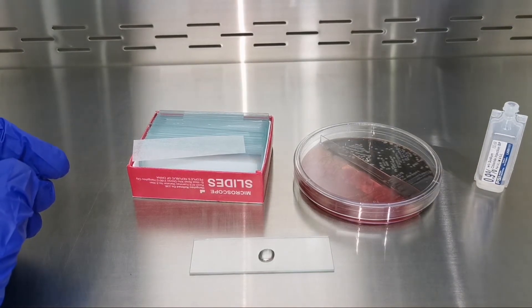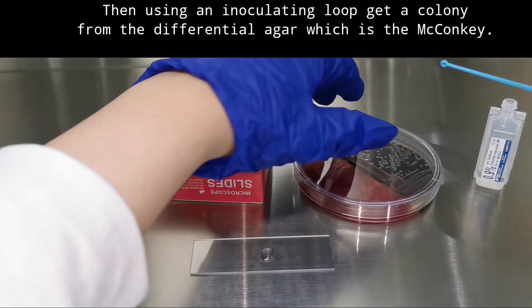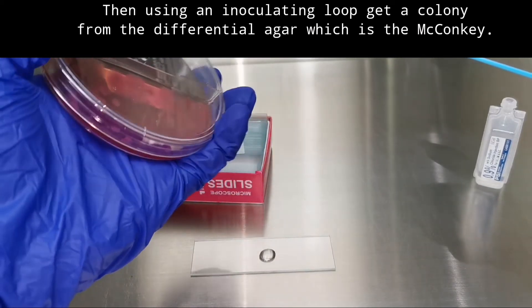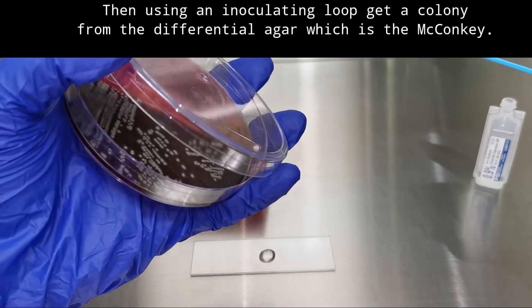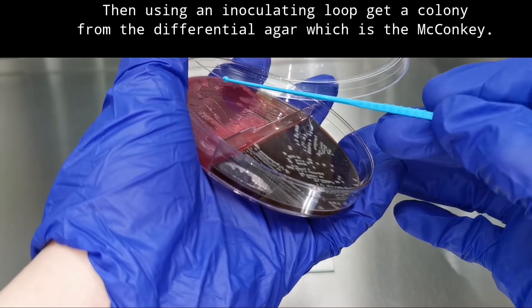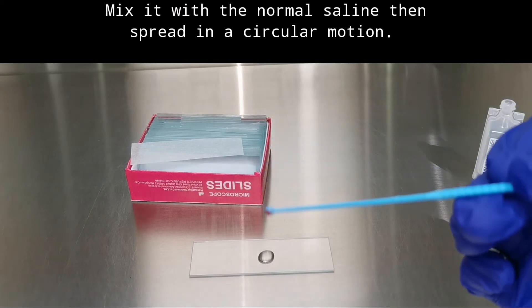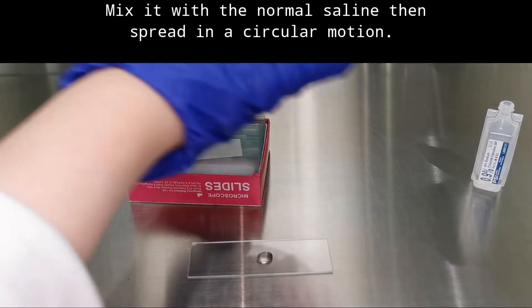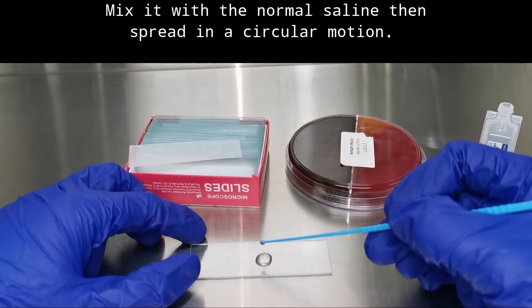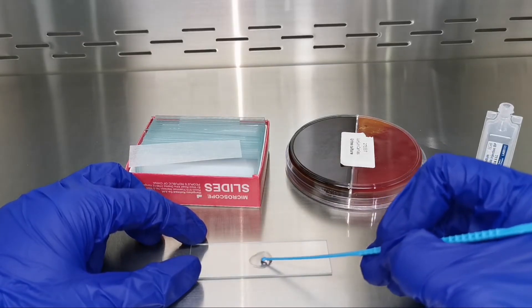Then get an inoculating loop — you can use plastic or metal, but for metal you should sterilize it first by bringing it to a flame. Then get one colony from the MacConkey agar — these are the pink ones — and mix it with the saline.